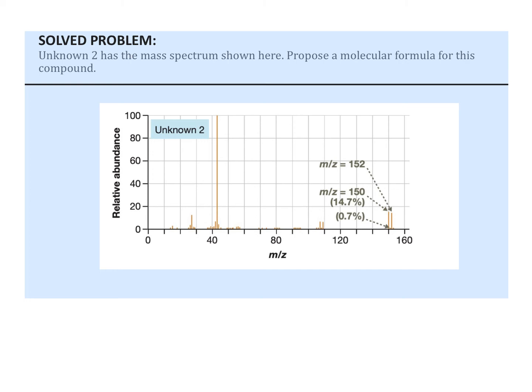We are going to go through our steps, right? And so when we go through our steps, the first question, of course, for step 1 is: are there 2 significant peaks separated by 2 atomic units at the high mass end of the spectrum? Now, if you look at the next 2 slides, I have places for you to fill in this information just because I like tables. If I skip ahead, it will make the screencast break up. So I'm not going to skip ahead to that, but I do want to point you to the next 2 slides.